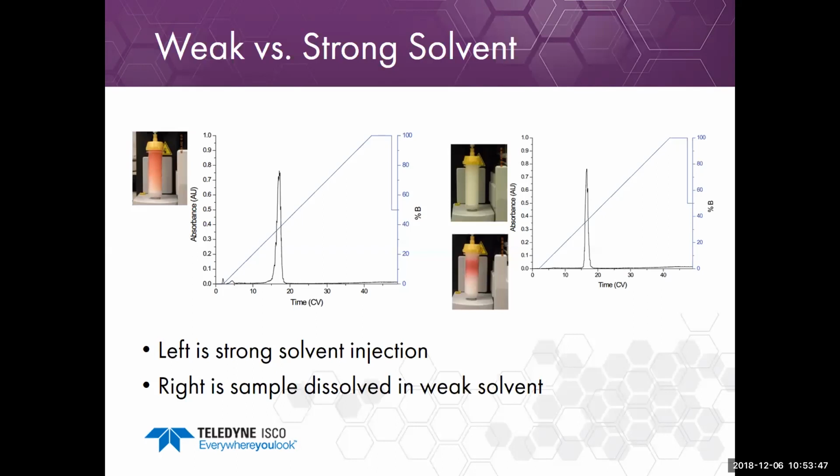I'm reading that it's very hydrophobic, and if you run it on C18, there's about three things I would try. One of which is you might increase the concentration of acetonitrile. That makes it a stronger solvent, and so it washes a hydrophobic compound down the column more quickly.